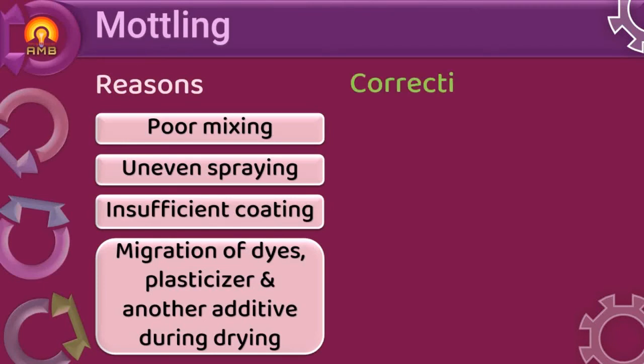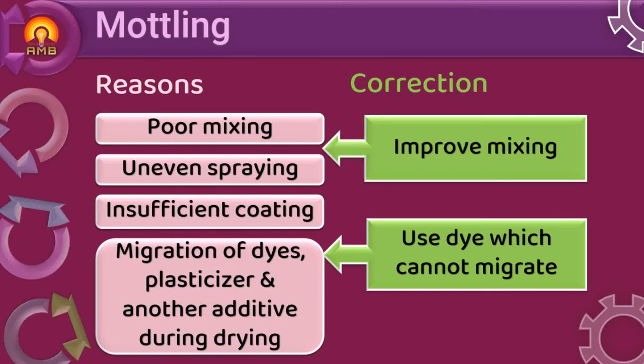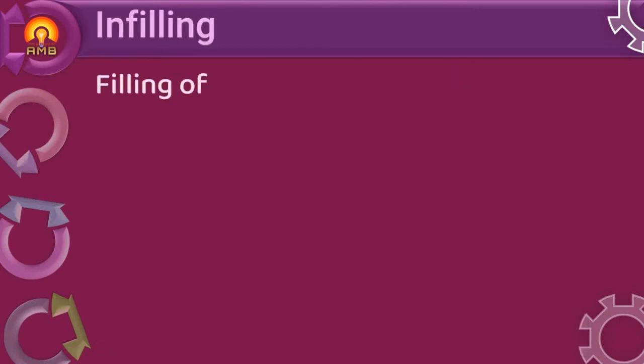It is corrected by using lake dyes which cannot migrate, improving mixing and correcting formulation by replacing plasticizers and additives. Next defect is infilling.